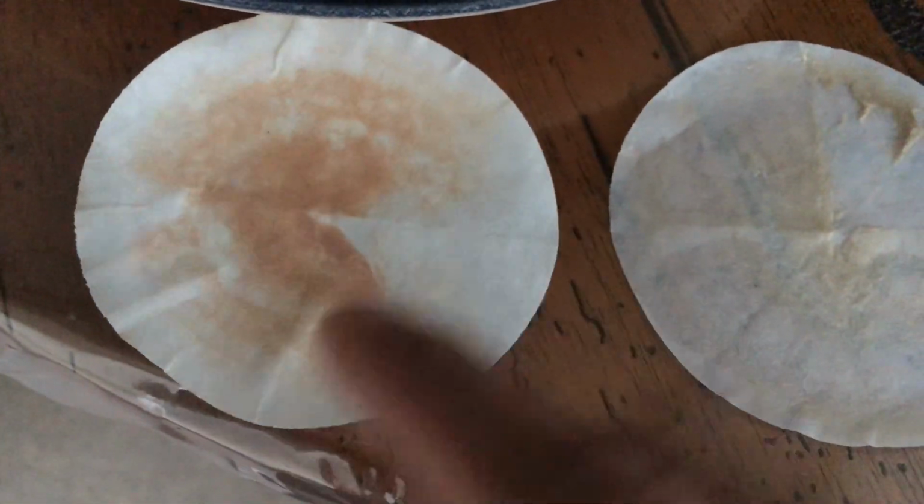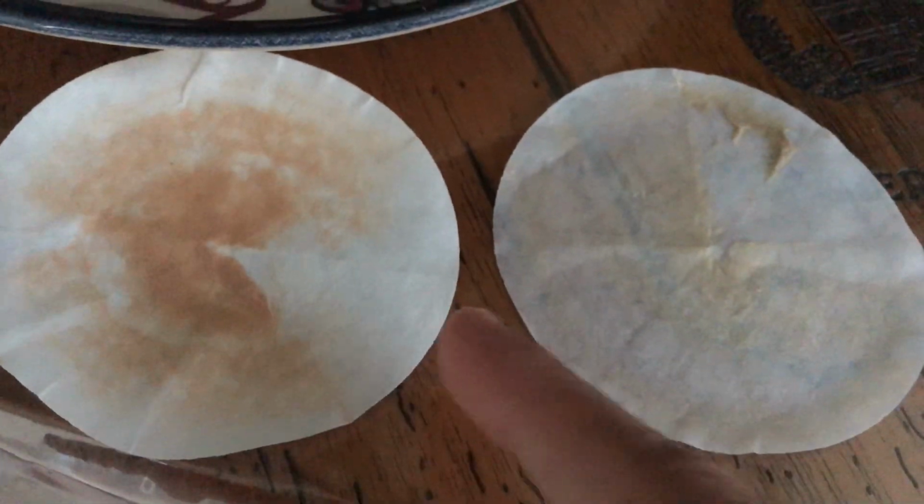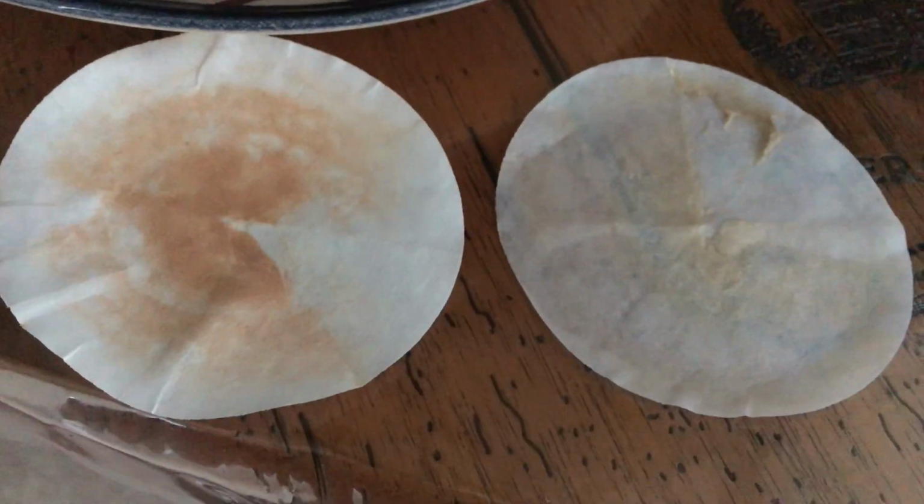So this is the carrot experiment, and this is the magnesium strip experiment. The main difference is the coloration. I didn't use a large amount, so the yield will not be measured. It's not the easiest to pick up on the camera, but the magnesium strip is slightly bluer, and this one is more of a green. So I don't think anything was converted, but it's very hard to tell.